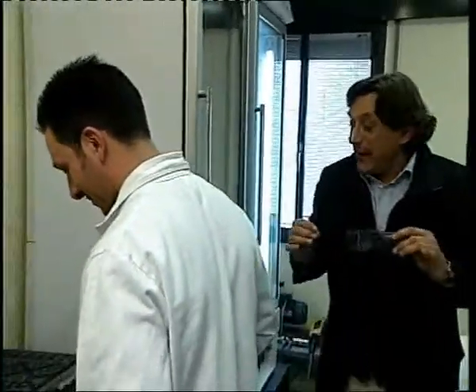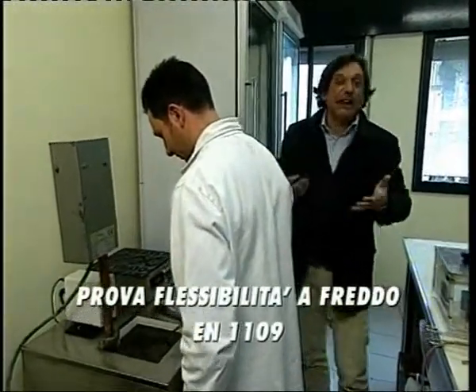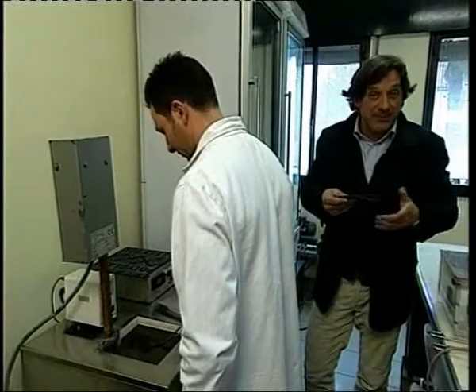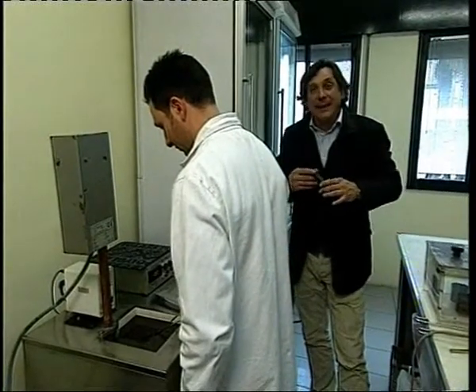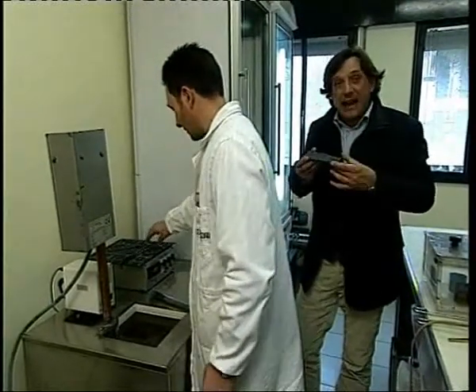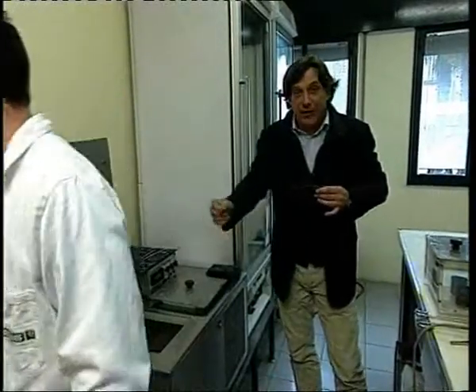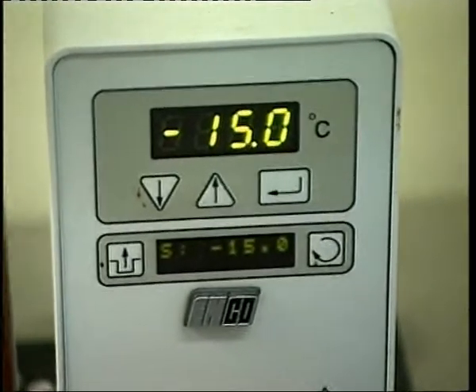Now, with the help of my colleague, I'll explain the significance of the cold flexibility test, perhaps one of the most important and widely known tests in the world of bituminous waterproofing. This test is conducted exclusively in the laboratory and consists in dipping a sample of material in the dimensions prescribed in a glycol solution that will progressively make the sample colder and colder at 5-degree intervals, such as 0 degrees, -5 degrees, -10 degrees, etc.